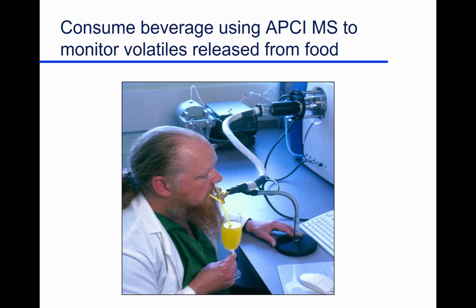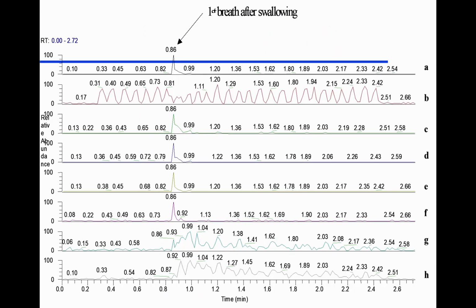We know exactly what stimuli they were given because we have a mass spectrometer that's measuring it. And so it's kind of fun because you can then monitor different masses to monitor different flavor compounds. This is monitoring one flavor compound, different one, different one, different one, and so on. This is breathing. He's breathing out, so it's measuring something. Breathing in, measuring nothing because you're sucking in.